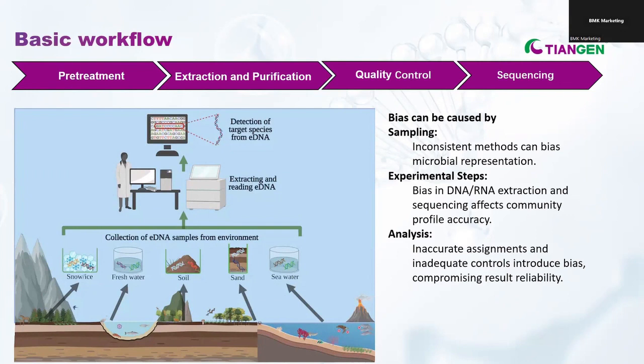Samples are collected in an appropriate storage tube or filtered through very fine paper, which traps loose cells and strands of DNA. The techniques to extract the DNA and read what DNA is present are the same as those used for tissue or blood samples, usually PCR or whole genome sequencing.